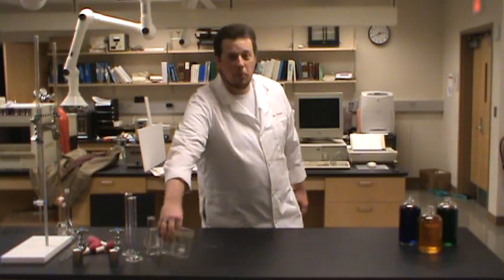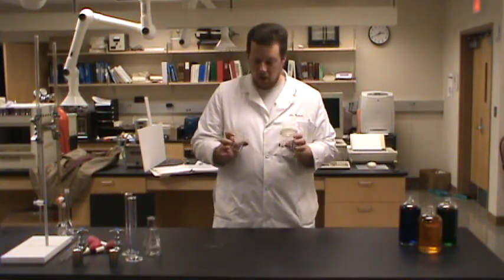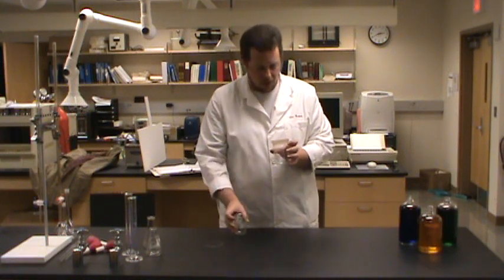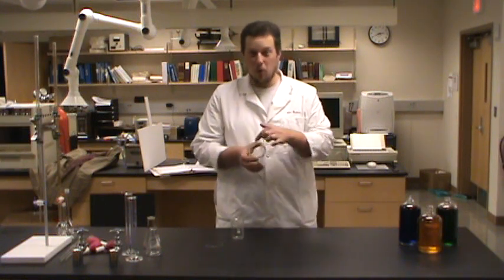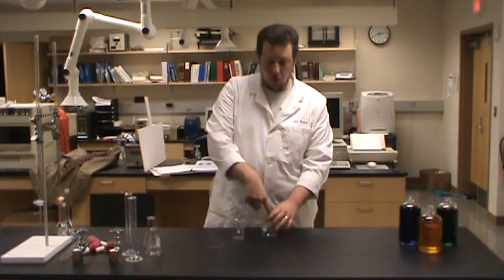The one that you're probably most familiar with are beakers. I've got a couple beakers here. But what are beakers really good for? Let's think about some of their features. They've got a flat bottom, so they'll sit on the bench. They've got a pretty wide open top, so it's easy to add things to it. It's easy to put probes and other things into the beaker.